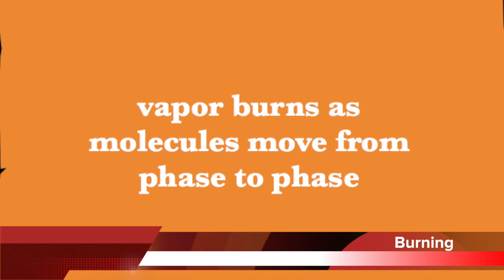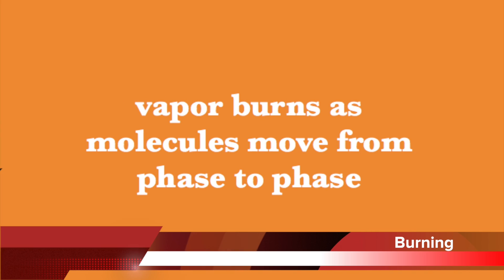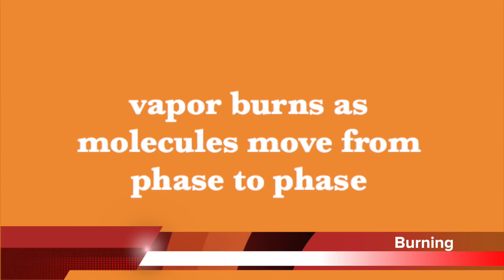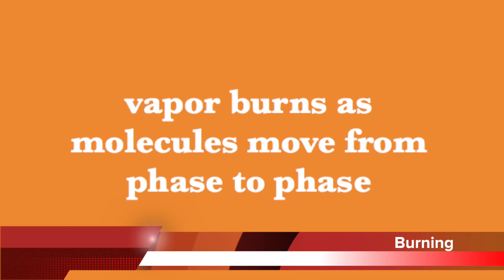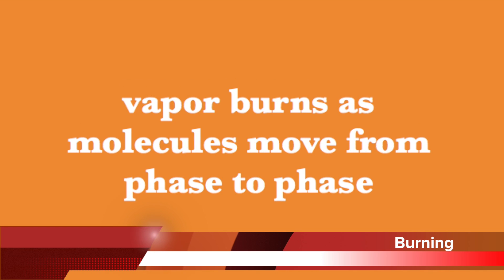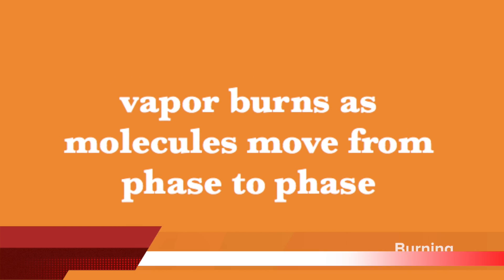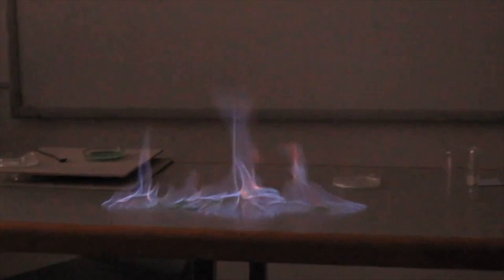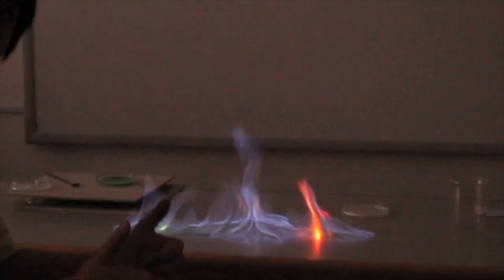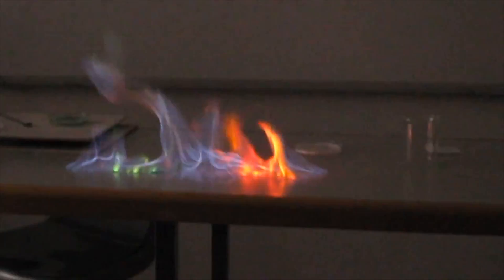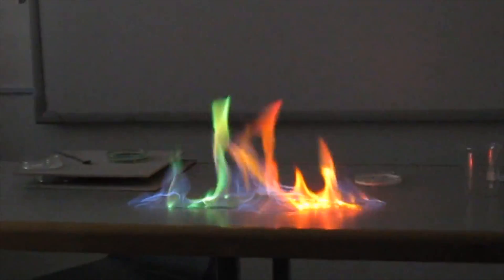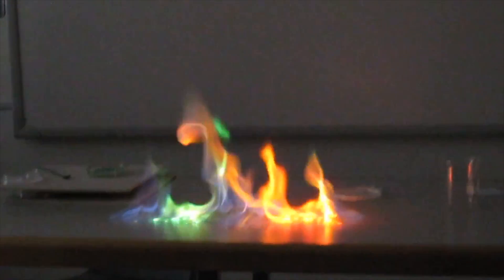Perhaps surprisingly, flammable liquids themselves do not burn, but rather it is the vapor above the liquid that burns as the molecules move from the liquid to the gas phase. If spilled on the bench top or the floor, these flammable chemicals quickly vaporize and air currents can spread them into a wide area where an ignition source could start a fire.